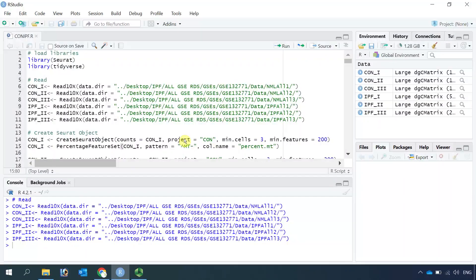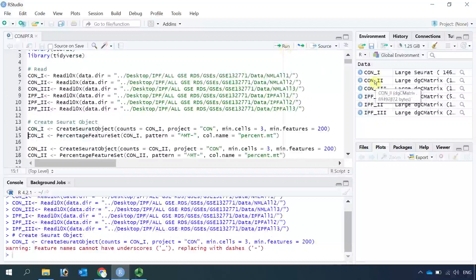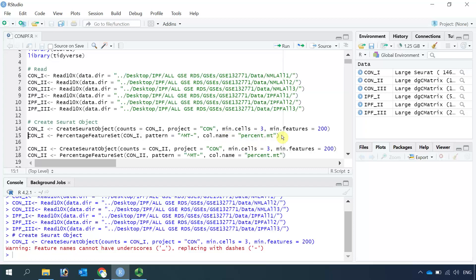This project name is important for us to compare control and IPF in the following integrated analysis. Let's convert control1 to a Seurat object. You can see control1 is a Seurat object now. We can use the PercentageFeatureSet function to calculate the percentage of mitochondria genes.